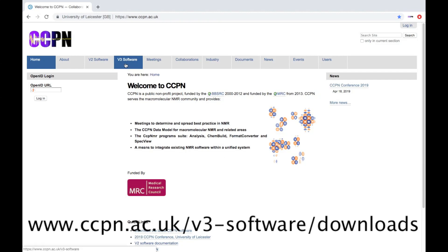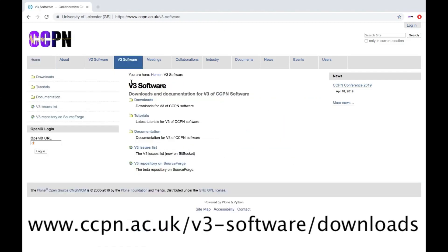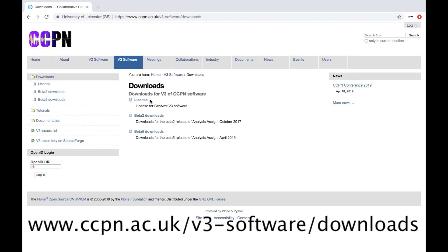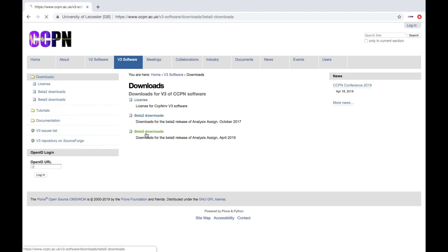or navigate to version 3 software, then to downloads, and then to the newest version.